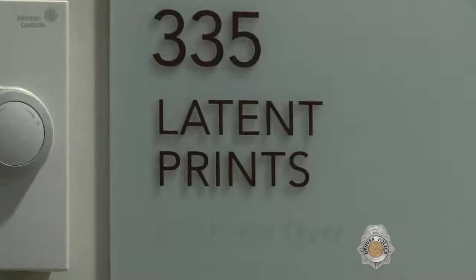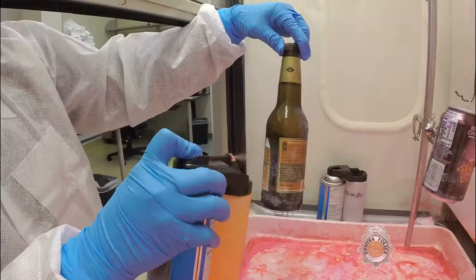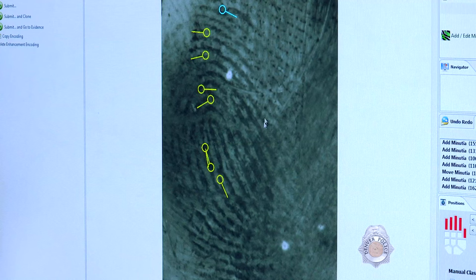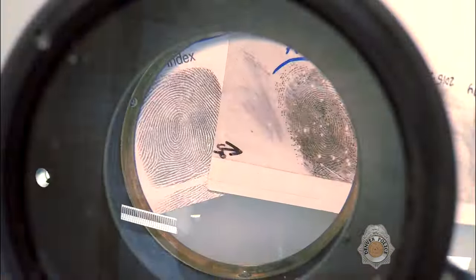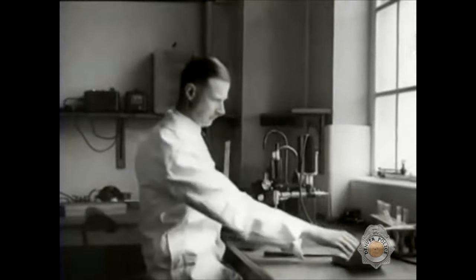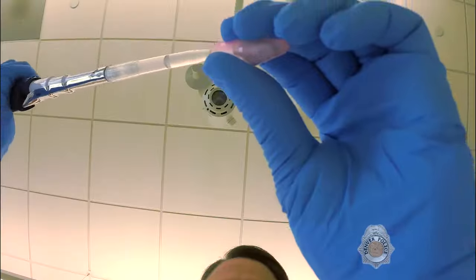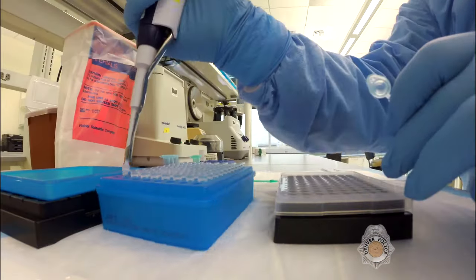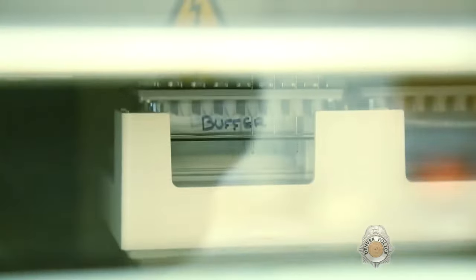This is called latent fingerprint. Fingerprints provide a positive means of personal identification and form an indisputable link in the chain of evidence. It is our responsibility to identify stains that are made by the various body fluids. Old-fashioned guesswork is replaced by certainty, saving hours in following useless clues.